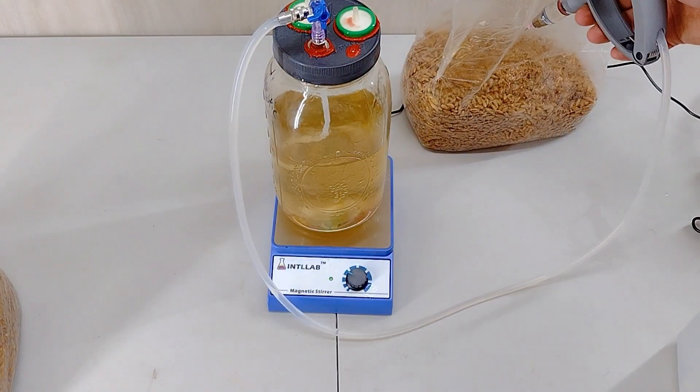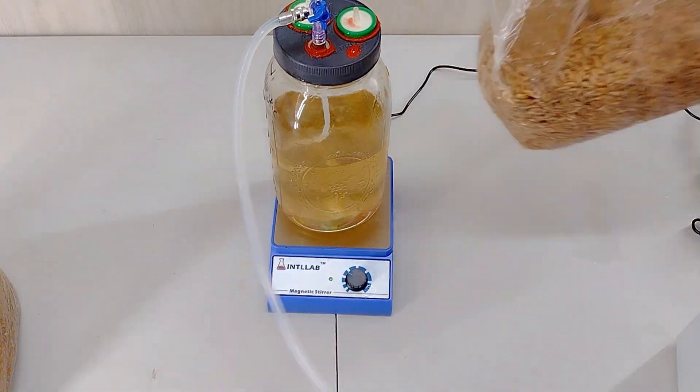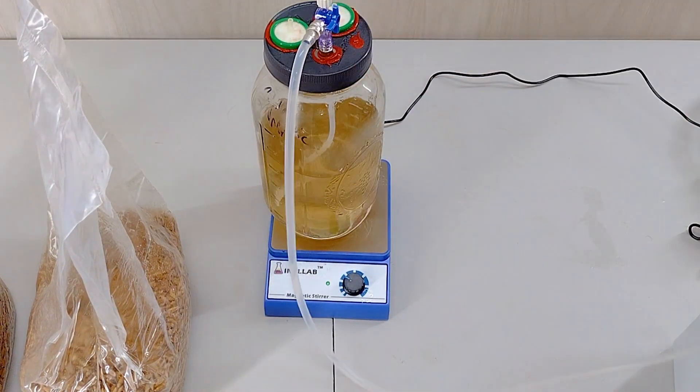When you're done, you just close your valve, spray it with some isopropyl alcohol, and put the cap back on there, and then it's set and ready for the next time you want to use it.